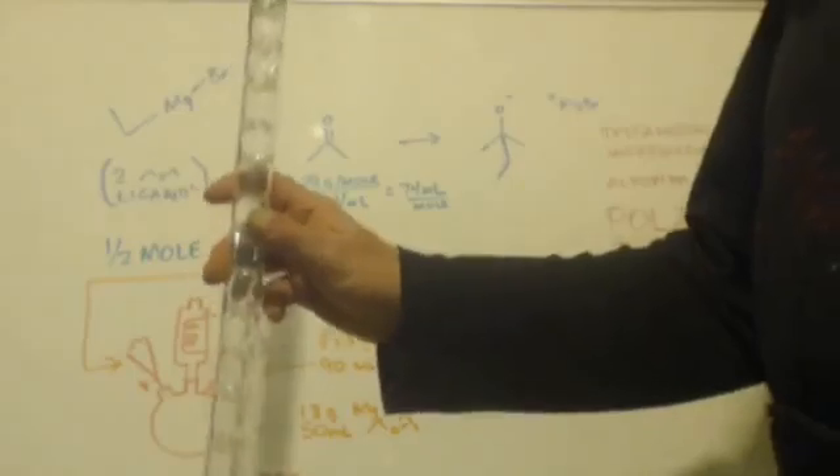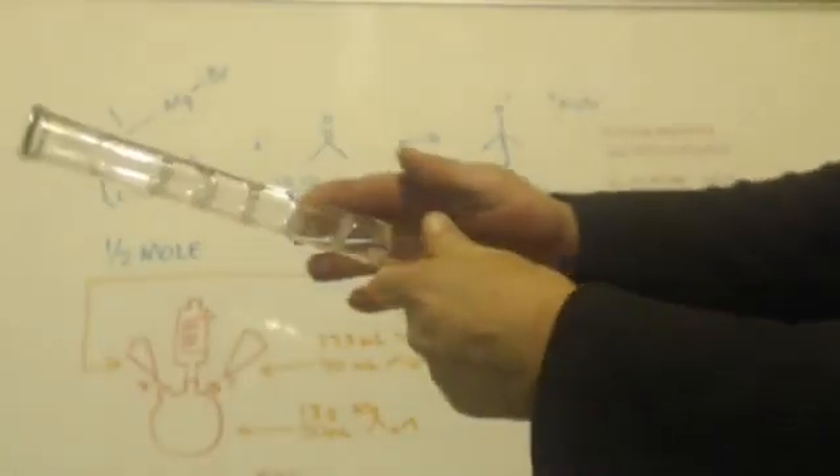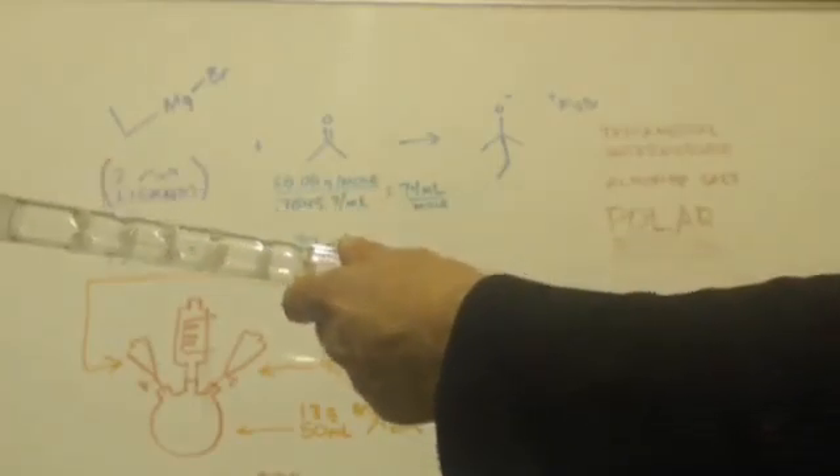What's the difference? An example of an air-cooled condenser — basically it's just a tube. This is a big Vigrex column that you would use for distillation. You have your pot here, and it can come up through here and condense, and eventually get to the top and go through your water-cooled condenser. But this can also be used as a condenser itself — your pot would be here, it would come up and turn into a liquid and go into your receiving flask.